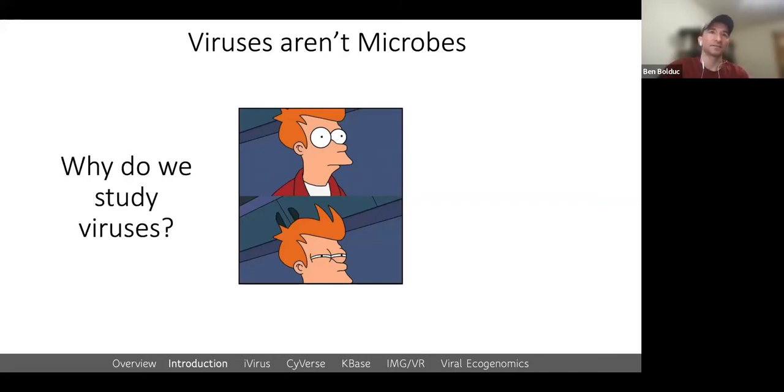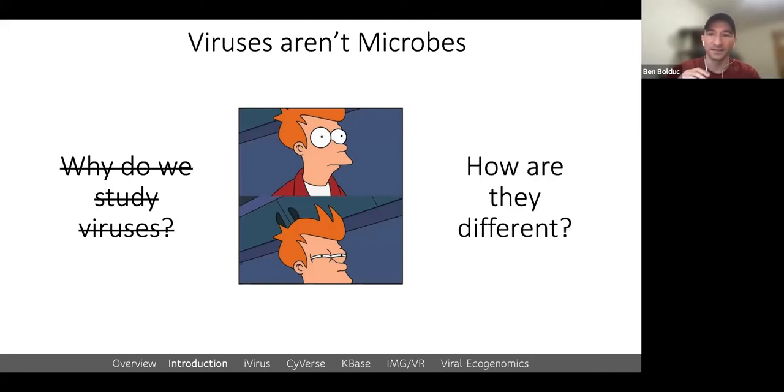The question we shouldn't be asking is, why do we study viruses? Because that in and of itself is several courses, and you're probably not here for me to explain why viruses are the most awesome things to study. Instead, for this session and for next week, the question is actually, how are they different? What do you have to do differently versus processing a microbial metagenome?